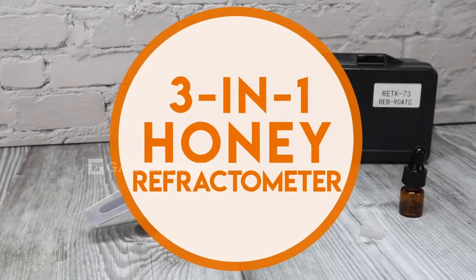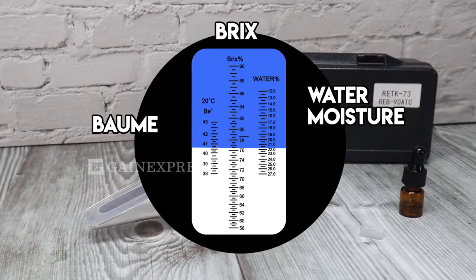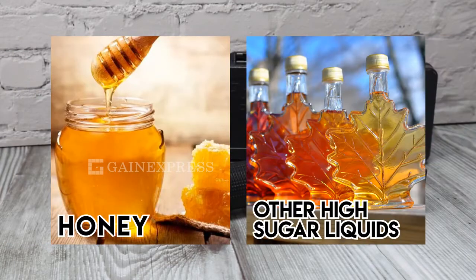3-in-1 honey refractometer. This refractometer can measure the percentage of water moisture, Brix and Baume level of honey and other high-sugar related liquids.